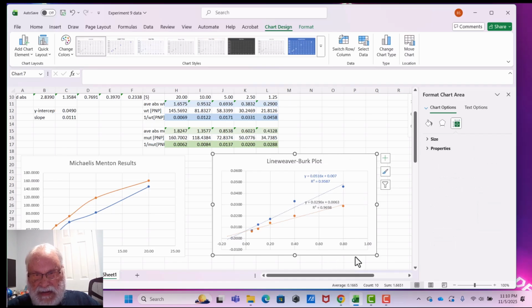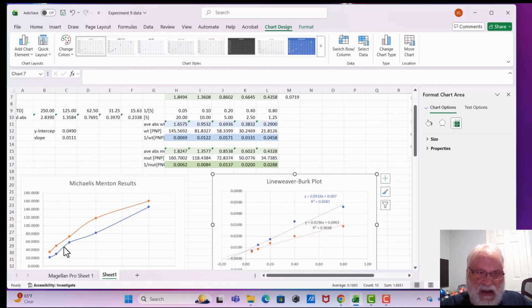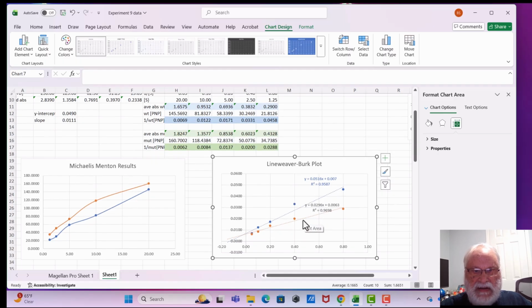So we now know what it is. So now we have those. It looks pretty good. The fit's 0.97, 0.9, about 0.96. They're not super great fits, but they're reasonably good fits. And I wanted to show you this is realistic. They won't completely fit. You see that some of these are not quite on a line, so you kind of expect not great fits. And that's one of the reasons.